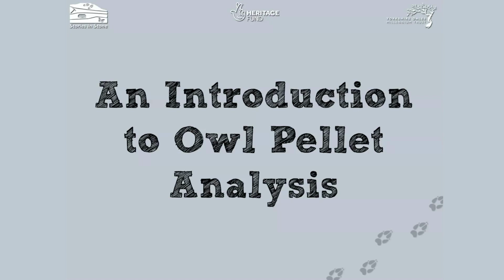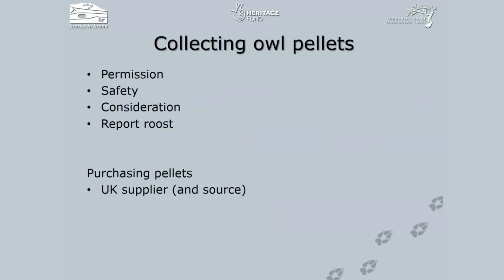This is part of the mammal series, and the reason we're looking at owl pellets is because of the predominantly mammal-based contents of those pellets. We'll be following the entire process through from the collection of pellets all the way to the identification of the remains that you find within.